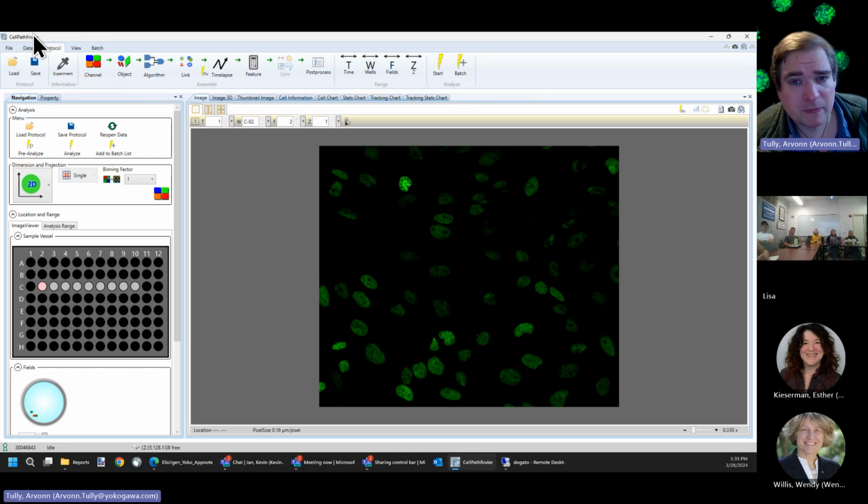Back when I was in a lab, I wrote plugins for ImageJ. I think my lab plugin page is still up. If you're going to do something weird and write a one-off paper, it's fantastic. You can't beat ImageJ. But if you want to get down to business, and I have a plate with 96 wells, and each well has 25 fields, and I want to run the same analysis protocol and get a single CSV that has everything, good luck doing that in ImageJ.